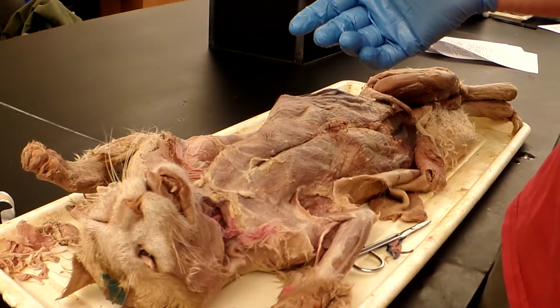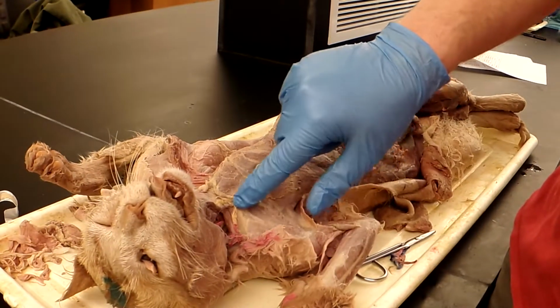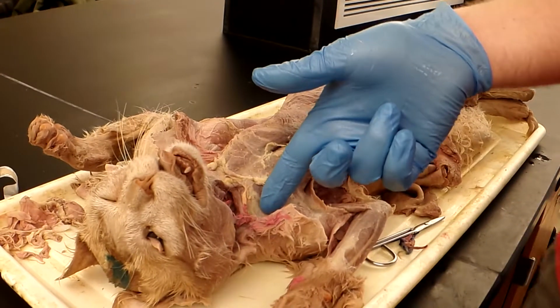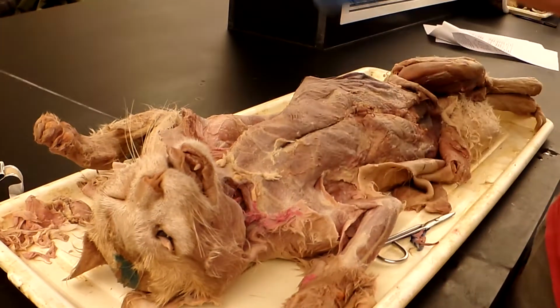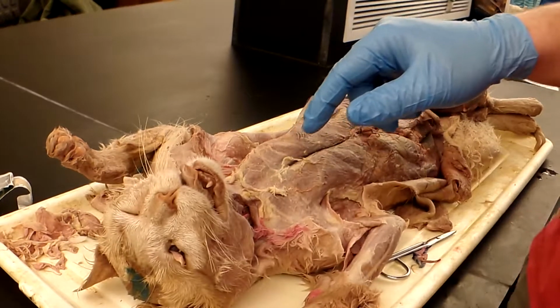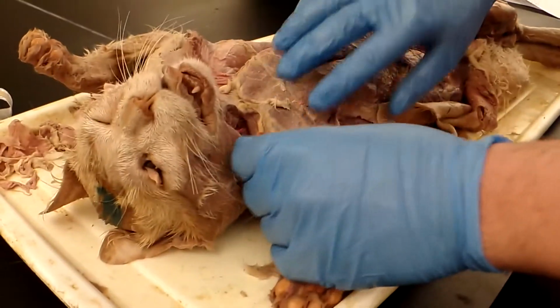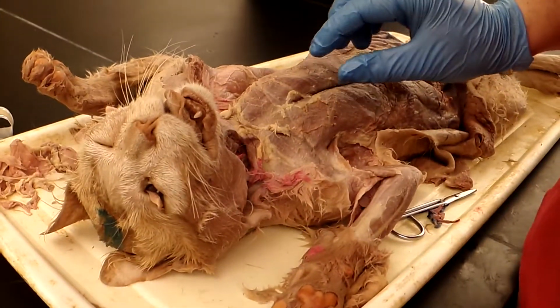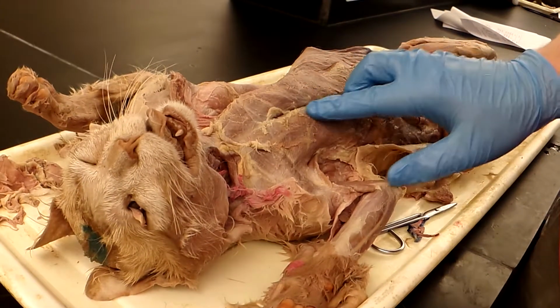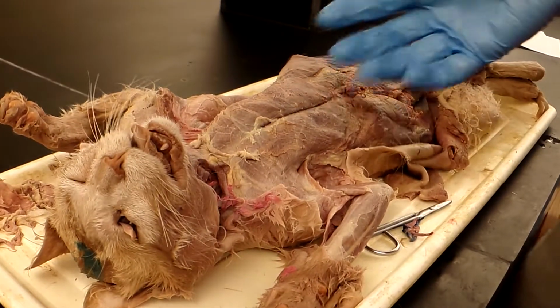Next is the pectoralis major, which is located right above the pectoantebrachialis. Origin is the sternum, the insertion is the humerus, and the function is also to help adduct the arms. Next is the pectoralis minor, located right down here. The origin is also the sternum. The insertion is at the humerus, and the function is adducts and retracts the arm.